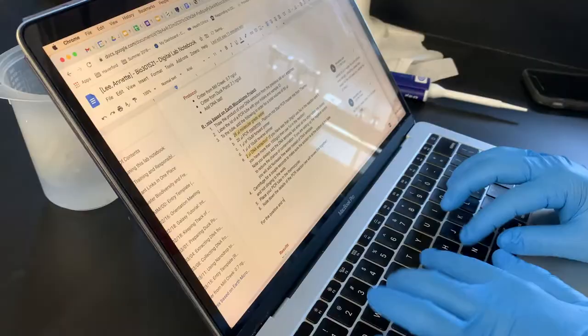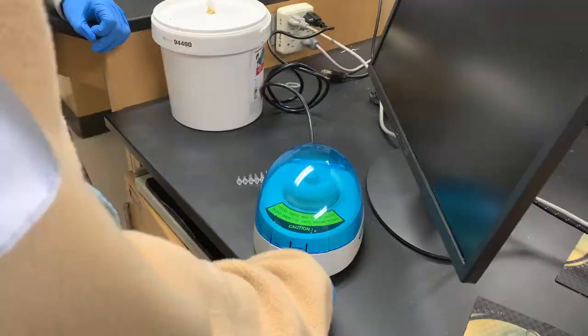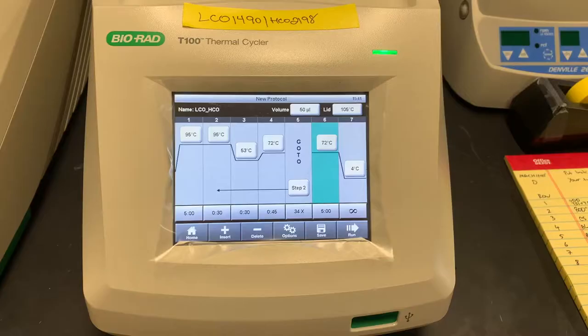After updating lab notebooks and centrifuging the PCR tubes, we briefly set them on ice while programming the PCR machines. Taking a closer look at the PCR process, there are three main stages.